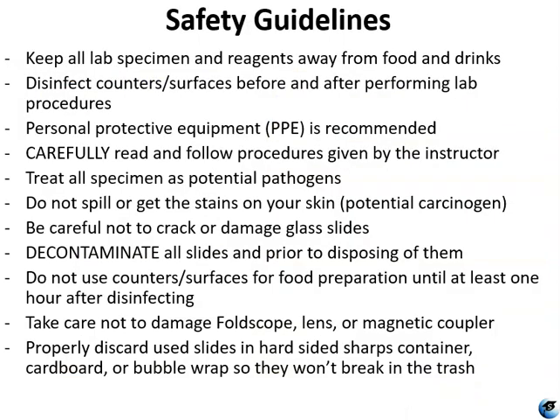For this lab, it's going to be really important to follow safety procedures. So as always, you want to keep all lab specimen reagents away from any food or drinks. Disinfect your counters before and after doing your procedures. If you have PPE, it is highly recommended. And make sure you carefully read all of the procedures. Treat all specimens as potential pathogens. But for this one, it's really important.